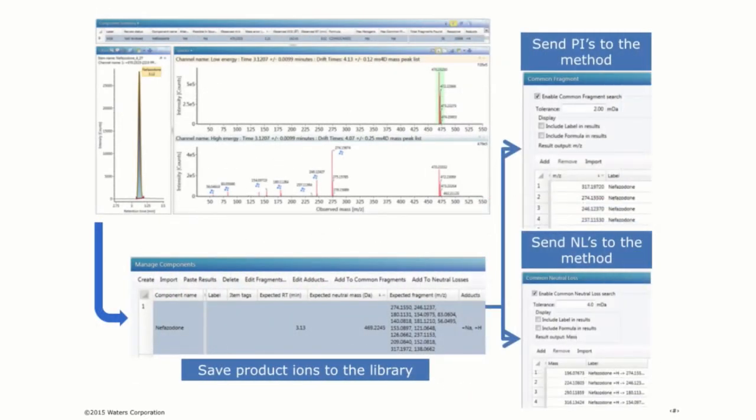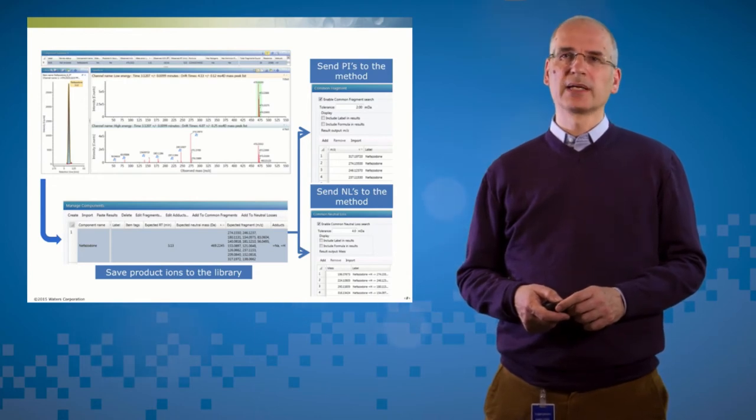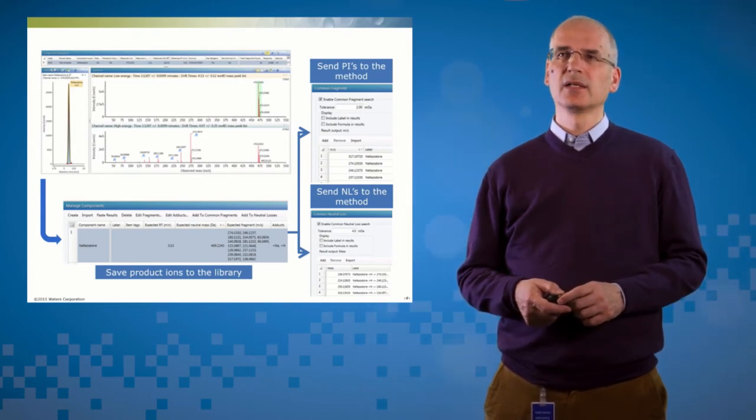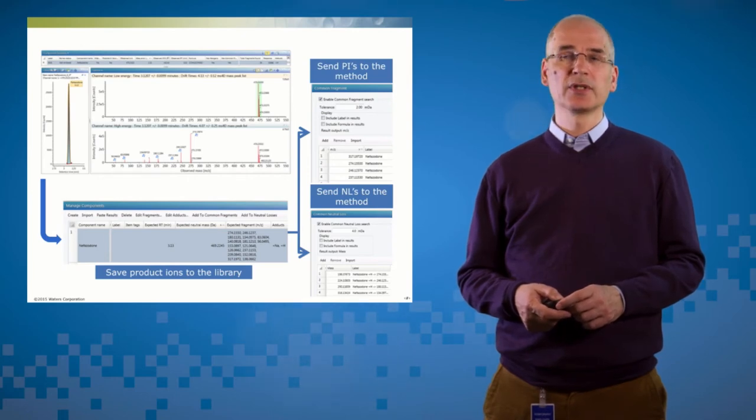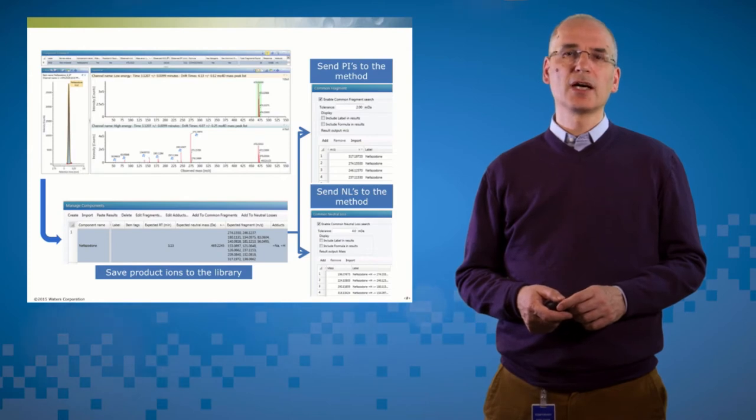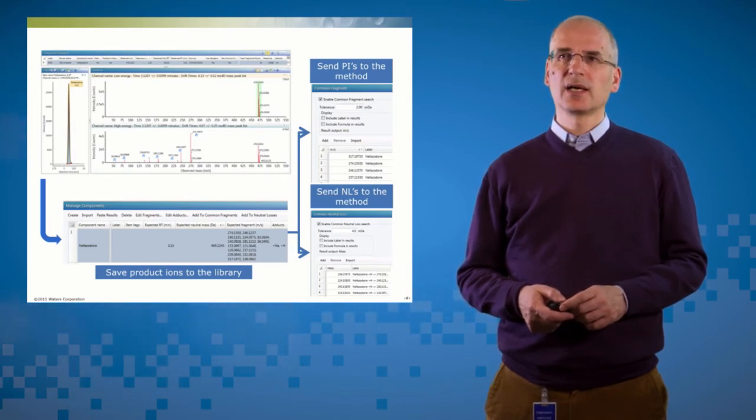So if I take that data and I analyze it in Unify, that allows me to develop a method which uses those precursor pieces of information. And on the top, this is how the workflow would run. I have the chromatogram top left. I've got a drift time resolved precursor ion spectrum on the top. And I've got a drift time resolved product ion spectrum on the bottom. And the product ions, which have got the small blue call outs on them, have been automatically assigned a structure by the software. So now I've got product ions for the parent compound. I can push those to the scientific library. And having pushed them to the scientific library, I can then pull them into the method and do two things. The first is I can define a list of product ions, which I'm going to look for in any detected components. But I can also derive the neutral losses for each of those product ions and put those into a neutral loss table. And both of those are going to help me find drug-related material.